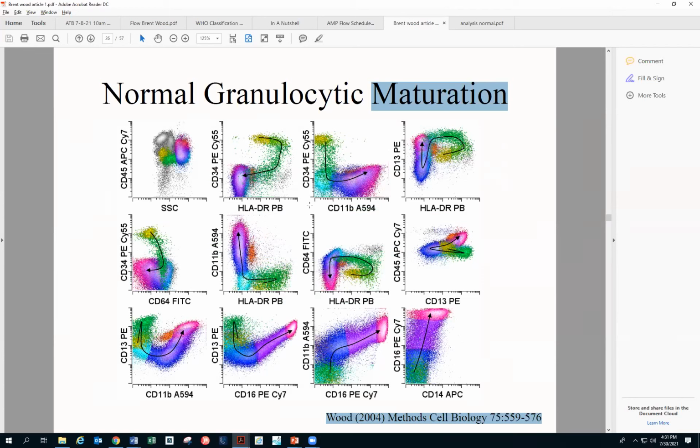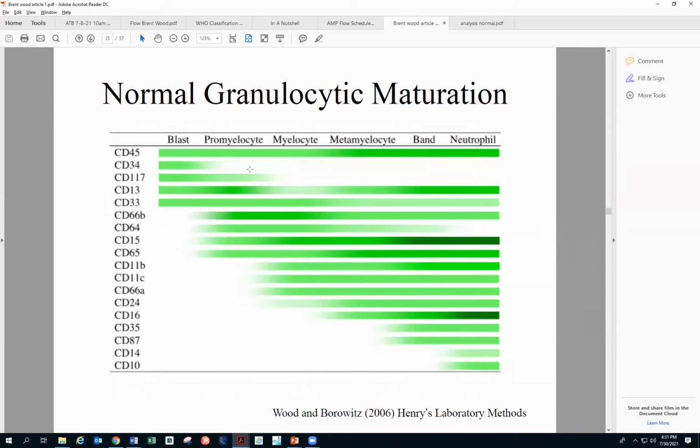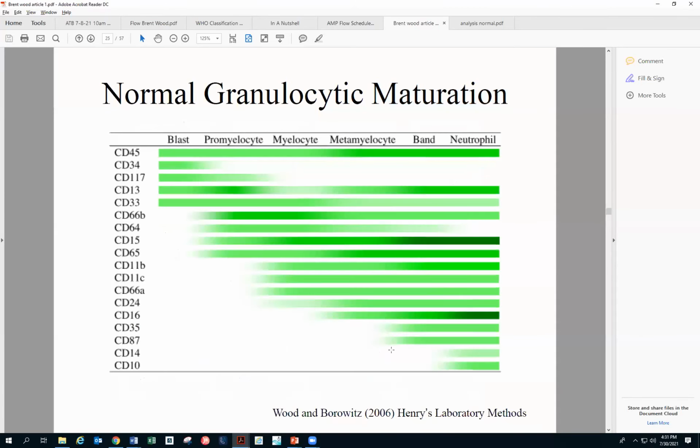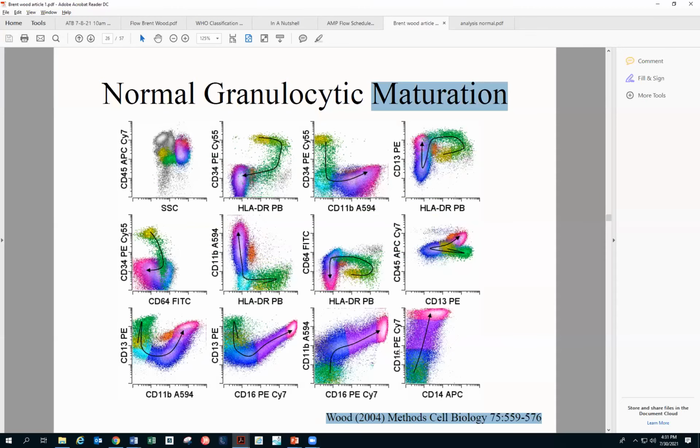It is the most difficult, so remember that what you are reading right now is the most difficult for beginners. But you don't need to mug up these things. You can just go back and see that kind of cheat sheet. Okay, this is what it looks like in my case. When you're starting, you can start doing that.